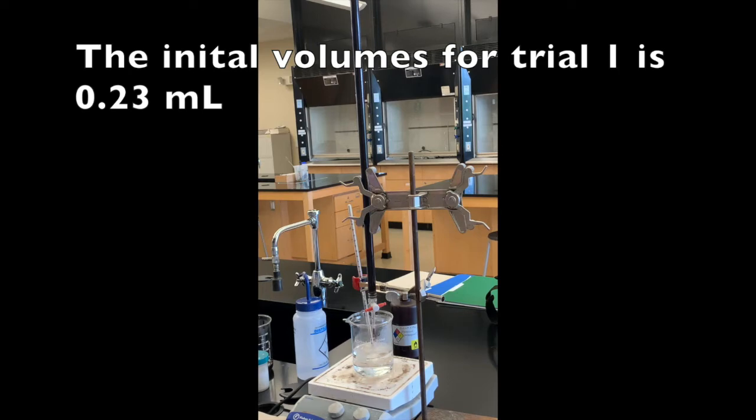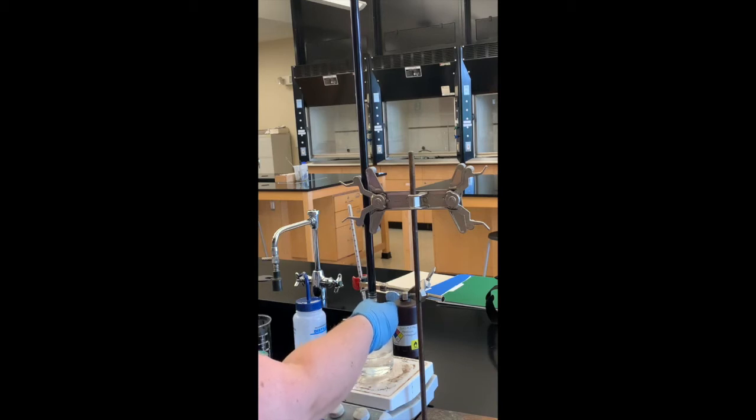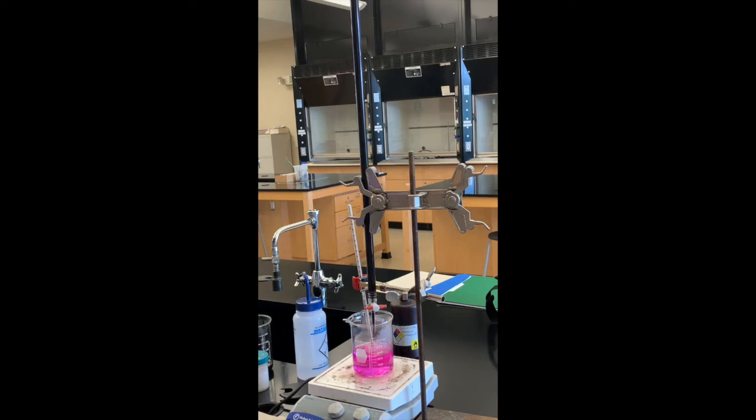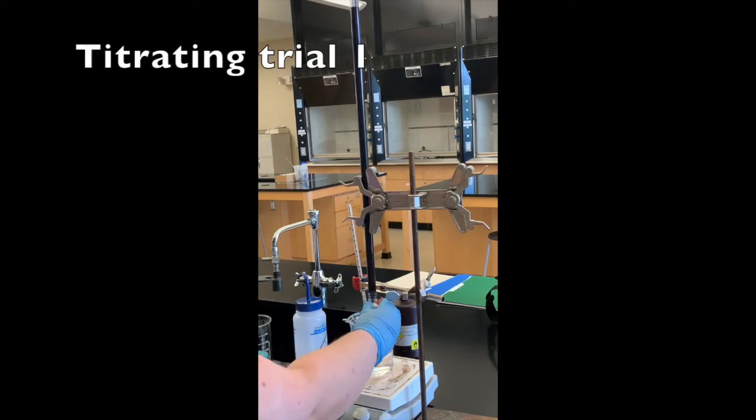I'm just going to start slowly adding this potassium permanganate until our solution turns pink. As a warning, sometimes the first drop will turn it bright pink but then the color will go away. We're looking for that hot pink color to persist in our solution. The initial volume was 0.23 milliliters — this pink color should go away in just a minute, and once it does we'll continue titrating. That was not the end point.